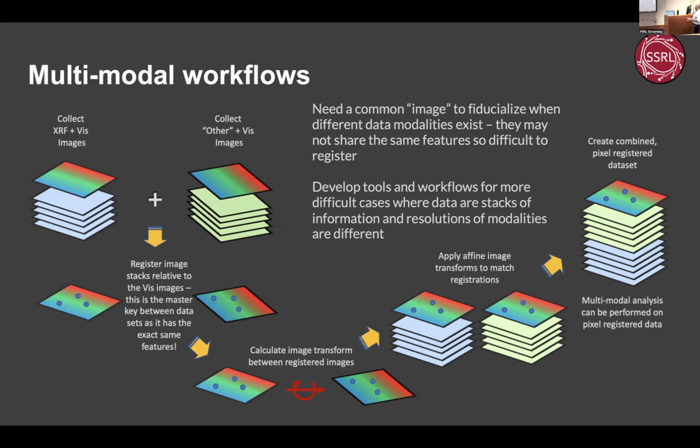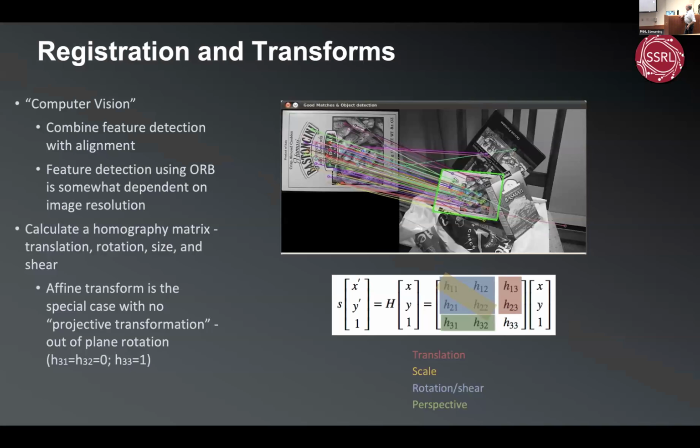Now, it sounds great and easy, and it sounds like a great idea. It's a little more challenging in reality. I see some smiling faces there going, of course it is harder than you think. But in concept, it's like, oh yeah, just take these pictures, match them together, and problems are solved. And it's just a transformation, right? It's just a mathematical transformation.